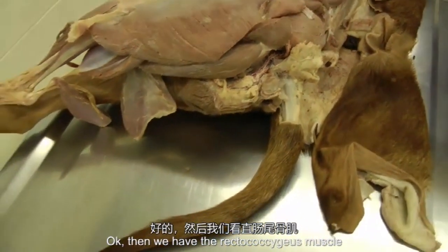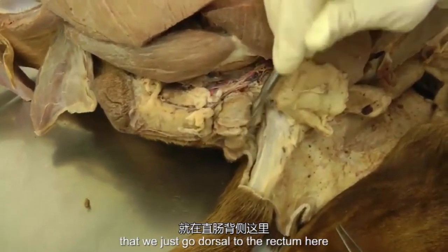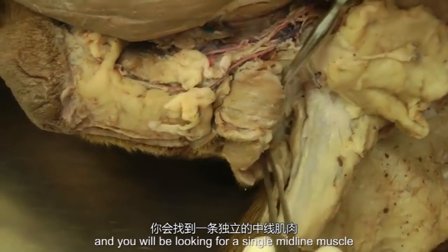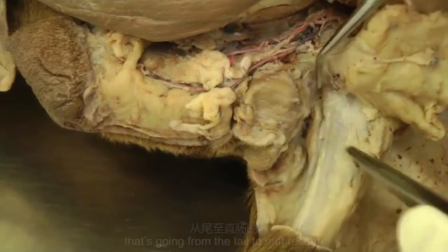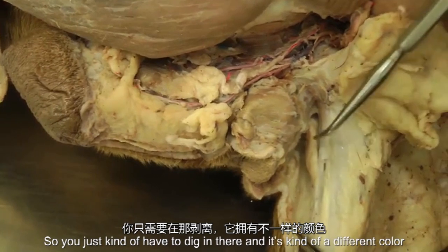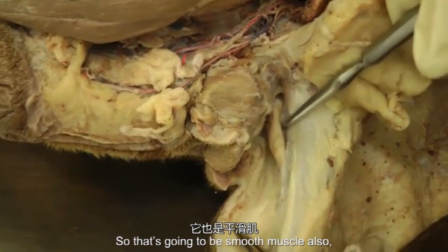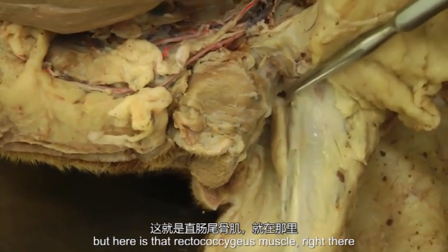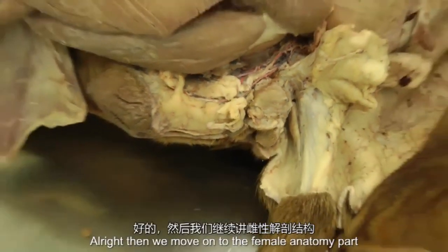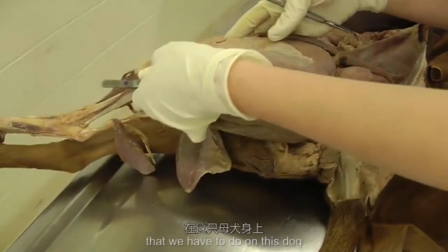Okay. Then we have the rectococcygeus muscle that we just go dorsal to the rectum here, dorsal to the anal column here. You'll be looking for a single midline muscle that's going from the tail to that rectum. So you just have to dig in there, and it's a different color, so that's going to be a smooth muscle also. But here is that rectococcygeus muscle, right there. All right, then we'll move on to the female anatomy parts that we have to do on this dog.